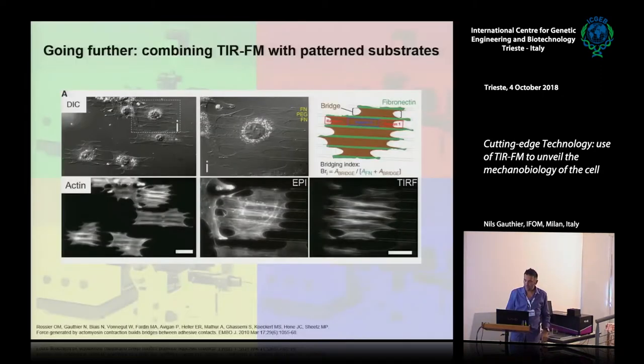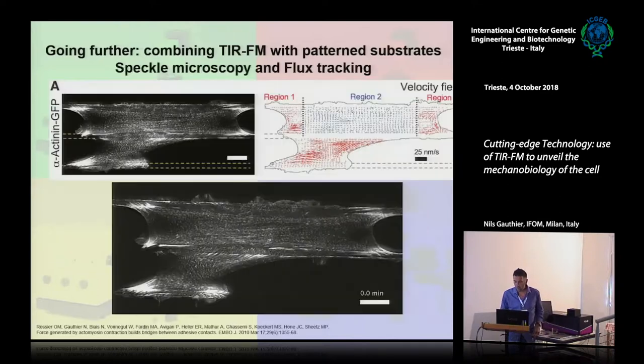Then you can combine, this is another story, for example here with micropattern lines. This was done with a friend of mine, Olivier, who is now in Bordeaux in France. What we did here is lines, to understand how cells behave above a non-adhesive substrate versus an adhesive substrate. Then you can answer this type of question.